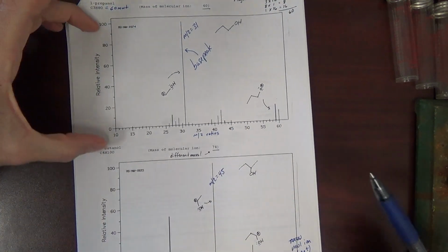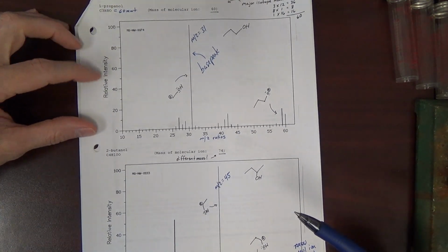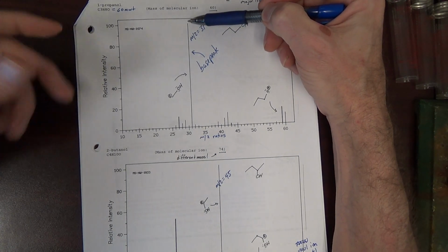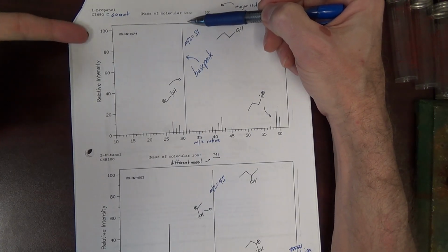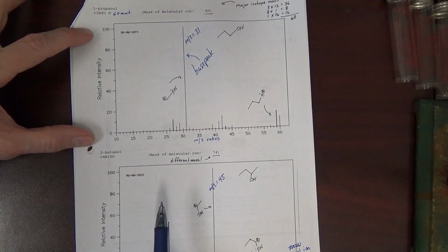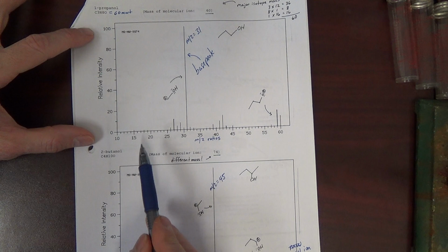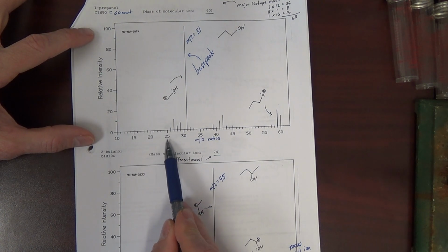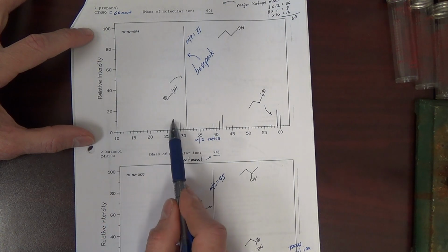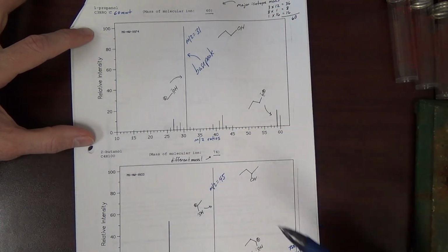Okay, the y-axis is basically just relative intensity. The base peak is always set to 100. There's really no units here. That's just like 100%. We just set it to 100, and everything else is relative to that. And then we can just basically say that the peak that's occurring at 27 has a relative intensity of about 10. So it's about 10% the height of the base peak.